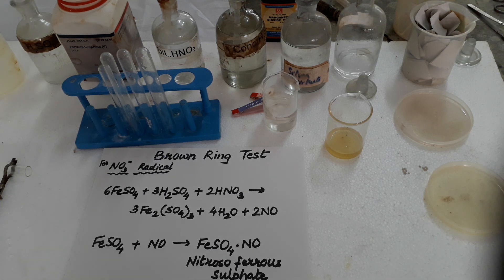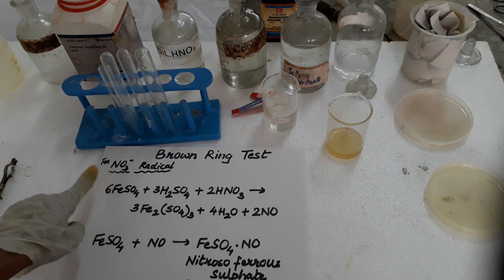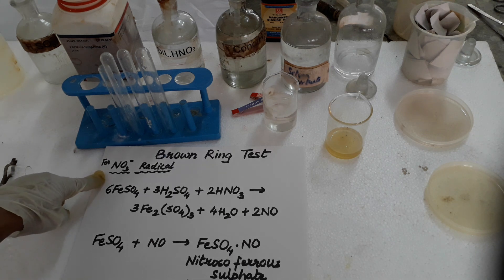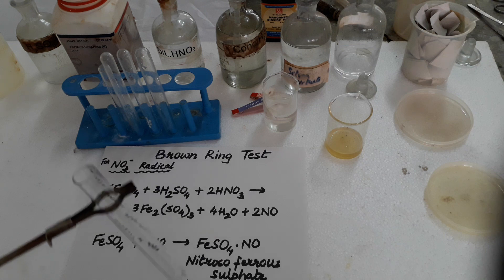Hello students, today I will show you how to perform the brown ring test. Brown ring test is actually for the nitrate radical — how to detect nitrate, or you can say for nitric acid also. Nitric acid has NO3 minus anion. So to detect the nitrate radical, we perform the brown ring test and we can confirm that the substance is having nitrate.